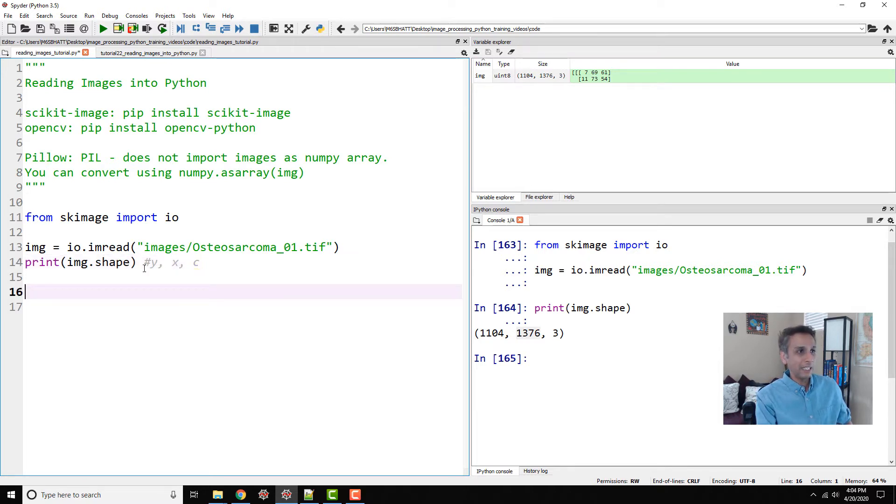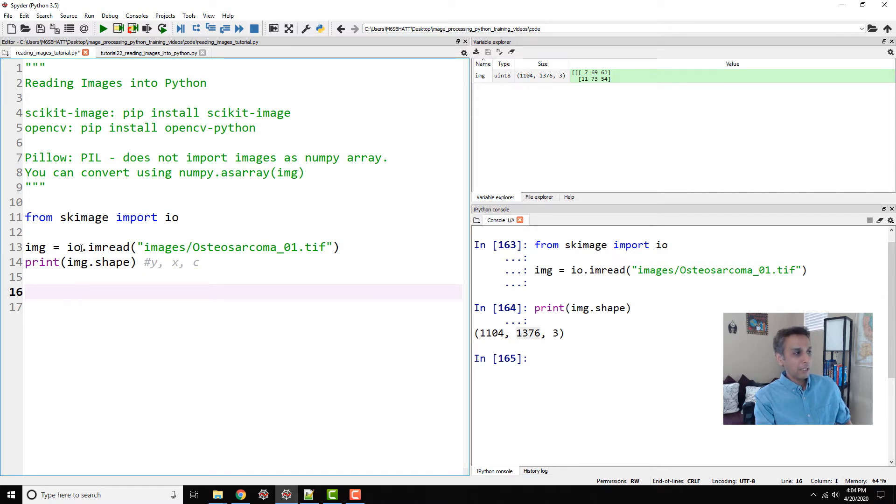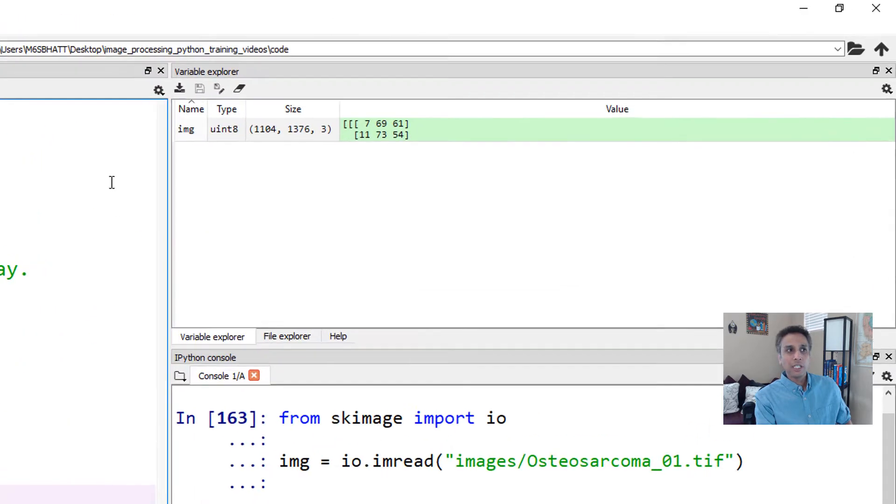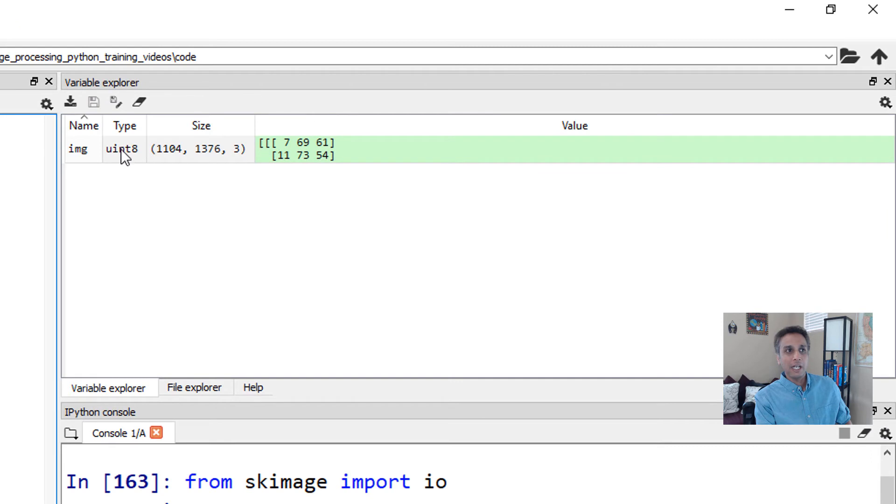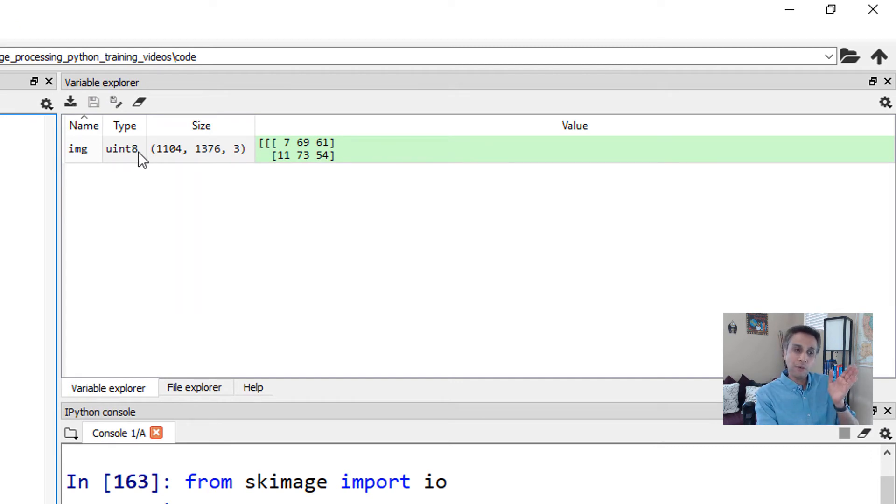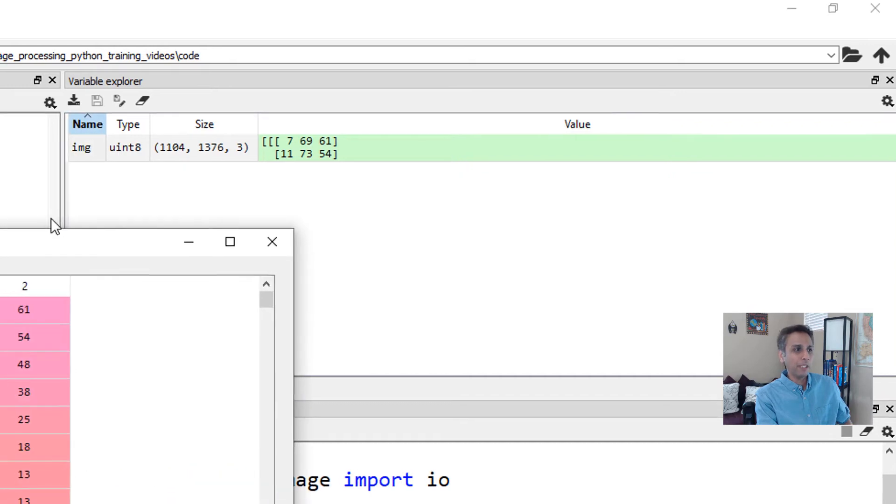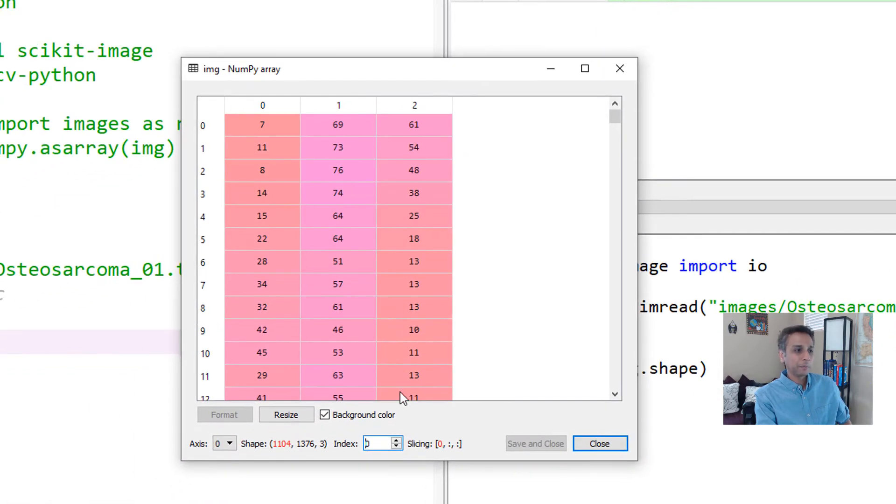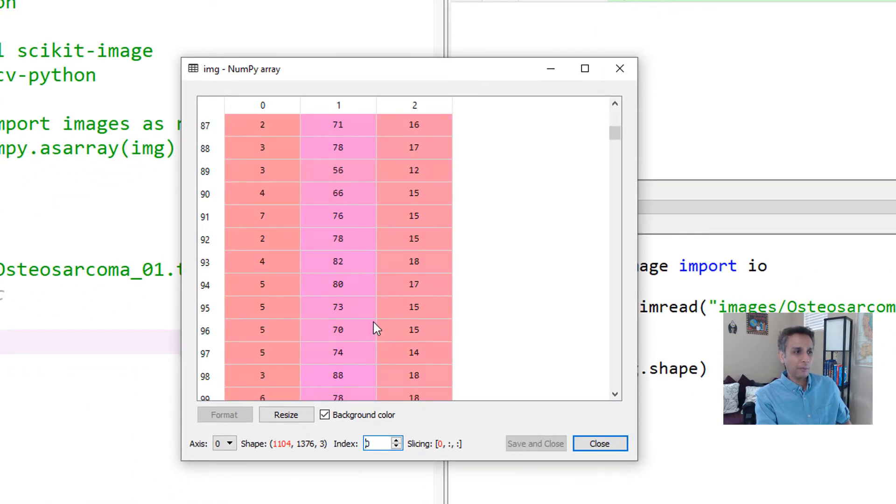So that's how you read an image. I'm importing this image using io.imread. So this image is an unsigned integer 8. Again, just to remind you that means the values go from 0 to 255. If I open this array, you can see that the values are all between 0 to 255.